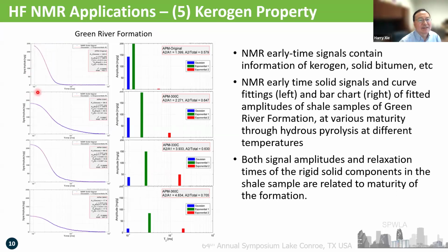If you look at the scale here, that's 10 to the minus 3, that's 0.001 millisecond, a 1 microsecond. Sorry, this is 10 to the minus 2, so 10 microseconds to start with, and a decay all the way to 1 millisecond. So this is the kind of decay.